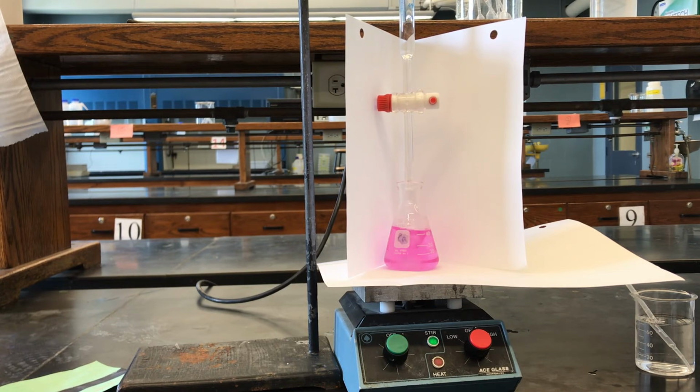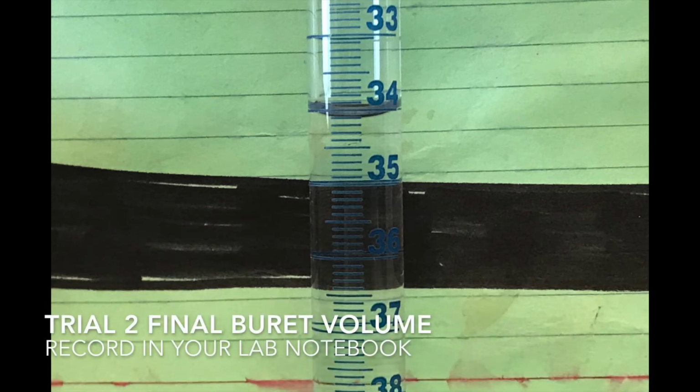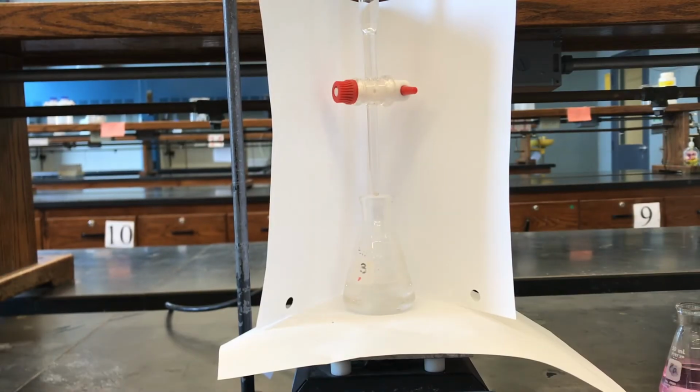So we're going to take a final volume reading. That meniscus is sitting right around that 34.1 line, so you choose. Decide what that final volume is. Is it 34.09? Is it 34.10? Is it 34.11? It is up to you to record in your data table as the final volume reading for trial 2. And now we're set up for trial 3.